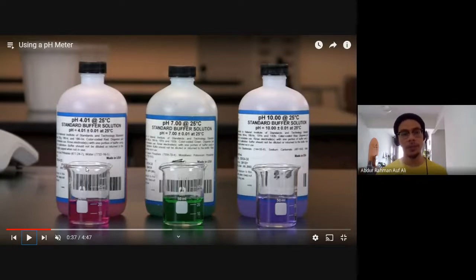So if we put the electrode in pH 4, the reading must come out as 4. If it drifts, say the reading becomes 3.5, that means something is wrong with the instrument. Okay? So that's why we test first. We want to make sure our instrument is working properly. So we dip the electrode in each of the solutions and make sure the reading matches the label. If pH 4, the reading must be 4. If 7, must be 7, 10 must be 10. After we perform all of this calibration, only then can we begin our analysis with our sample solution.